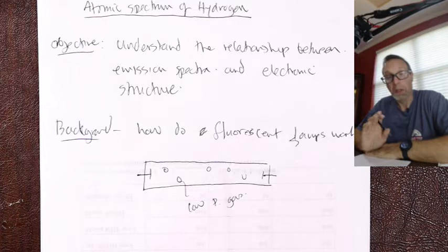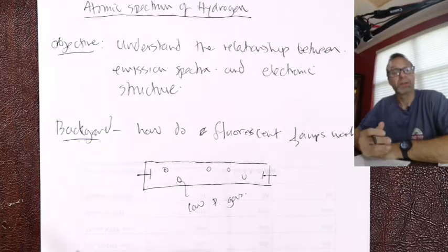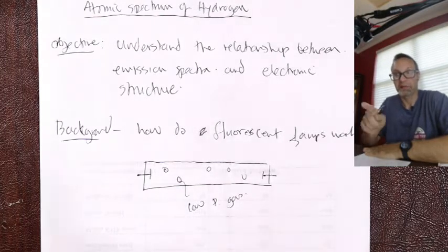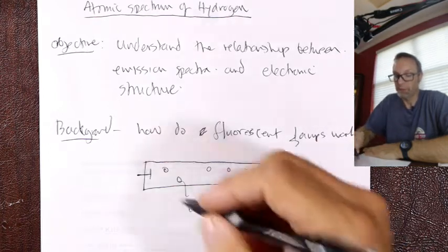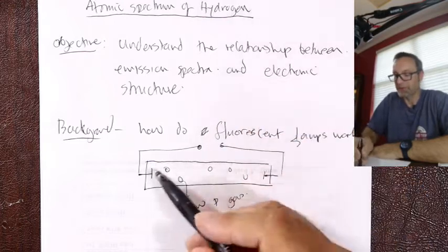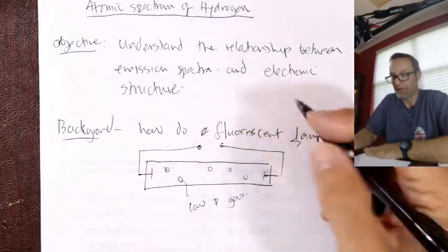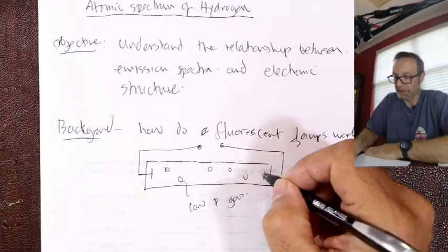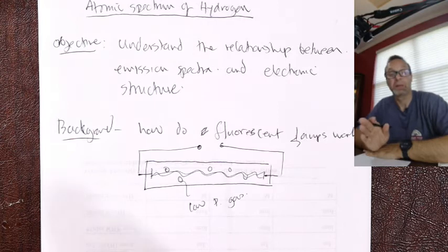Now, low pressure, because we talked about it when we talked about the ion cannon. Ions or electrons can only fly across a gap if there's nothing in the way. So because it's low pressure, when we attach this to the electricity, we have a large voltage, a large potential difference. It's like a ball rolling down a hill. If we have a plus and a minus end, electrons will basically shoot across here. It's literally lightning in a ball.